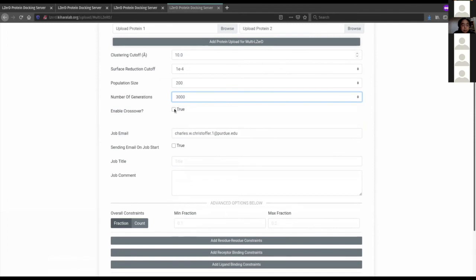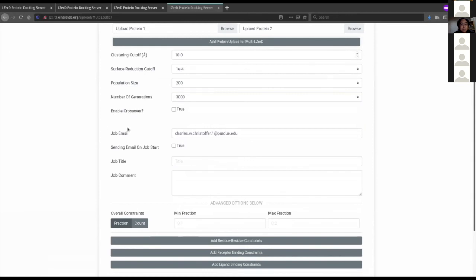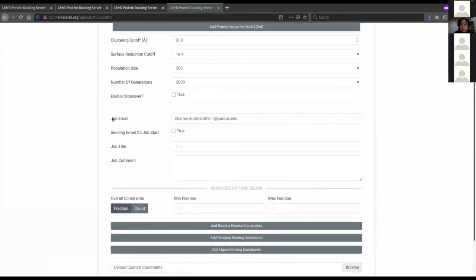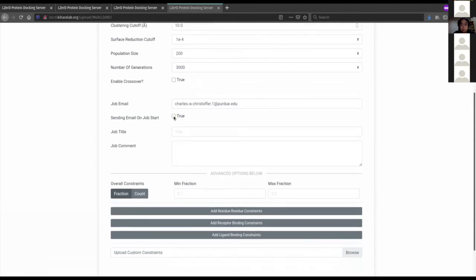There is a crossover checkbox — this is probably not useful for most users, but if you know that your population of models fits into a narrow classification and you think mixing and matching pieces will give better outputs, you can use it. But if you want to do that kind of complicated modeling with Multi-LZerD, maybe talk to us instead. Just like before, there's the job email, a checkbox for start notification, job title, and job comment.